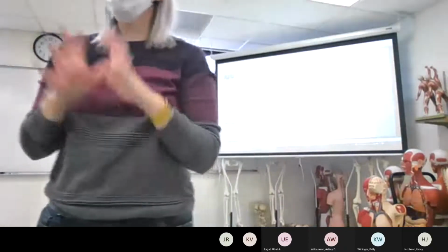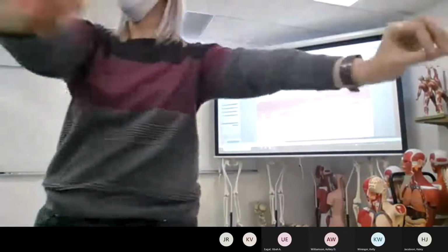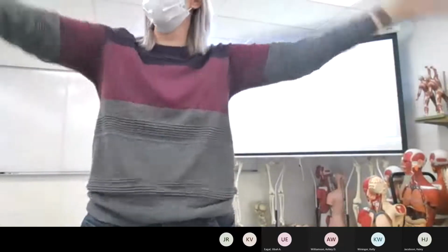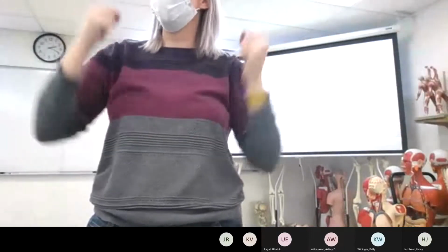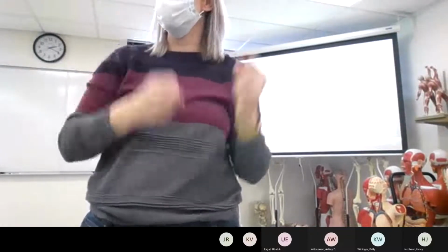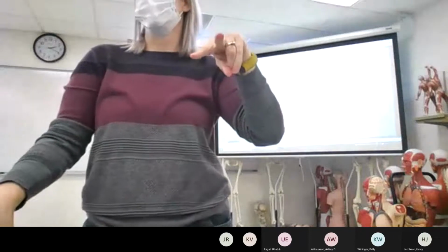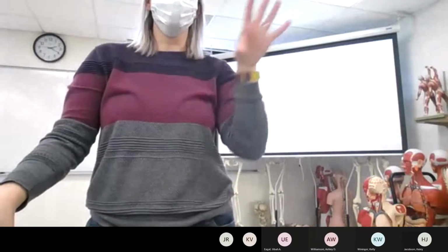Okay? I do not have a model for pseudostratified ciliated columnar cells. So if I'm going to ask you about pseudostratified ciliated columnar, I have to do it by slide or by picture. Okay? Because there's no model.